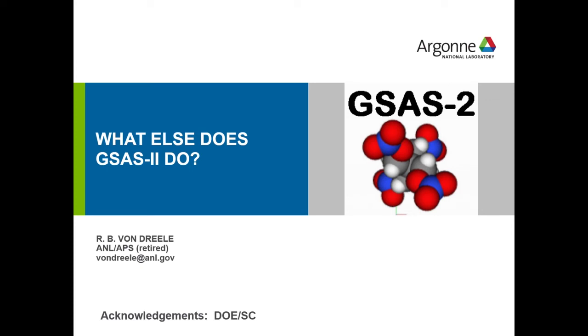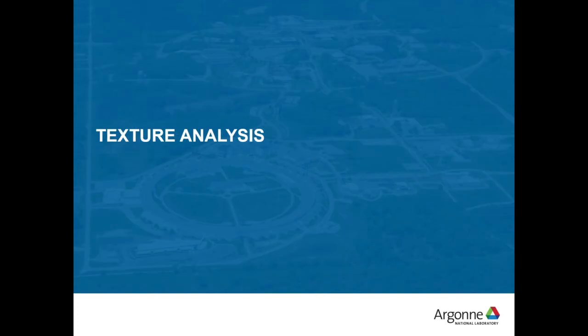What else does GSAS II do? Yeah, this by its very nature is going to be a helter-skelter talk. It's going to be little bits of this and little bits of that. There's like, I don't know, 15 or 20 different possible things I'm going to talk about. I can't remember how many subtopics there are in this thing. But the first one we're going to talk about is texture analysis.